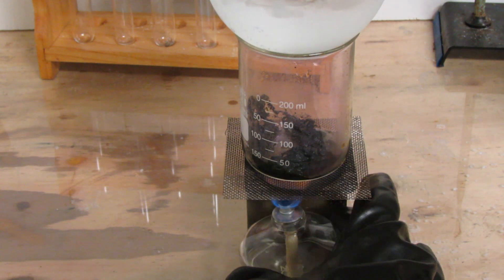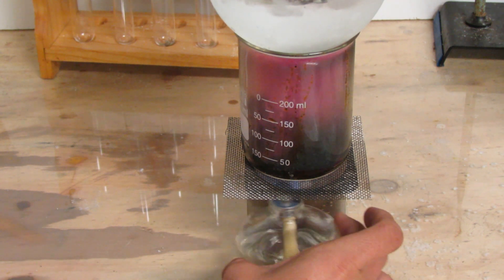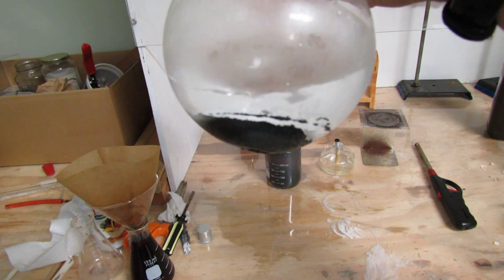Purifying your iodine is easy. Place it in the bottom of a beaker and set a round bottom flask on top of the beaker with cold water in it. Heat the iodine and it will sublimate and recondense on the bottom of the flask. Here's the final product of purified iodine.